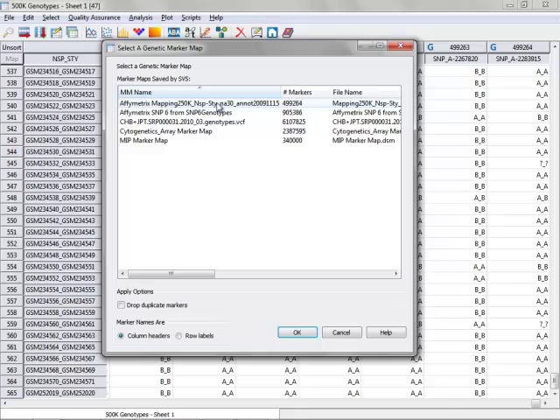which is a combination of both the 250k arrays, which together make up the Affymetrix 500k array. So I'll select that and click OK.